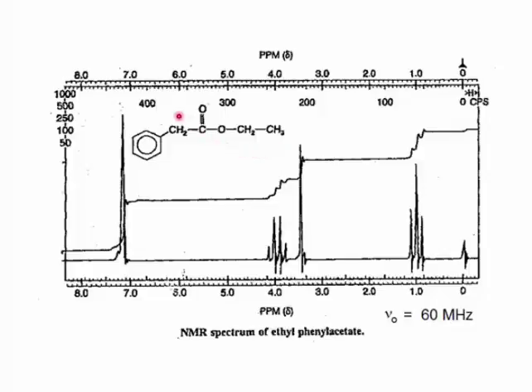Now, what about the other methylene here? What about its expected splitting? It's attached to a carbonyl carbon, attached to a benzene ring carbon. We'll notice that there are no neighboring protons. There are no hydrogens attached to that carbon, and there are no hydrogens attached to that. So there are no neighboring protons, and this CH2 is unsplit. It's just a singlet. And indeed, when we were examining these two, it's this one that's the singlet, and therefore we ascribe this unsplit singlet to this methylene. That's our assignment: this methylene here is associated with this signal.